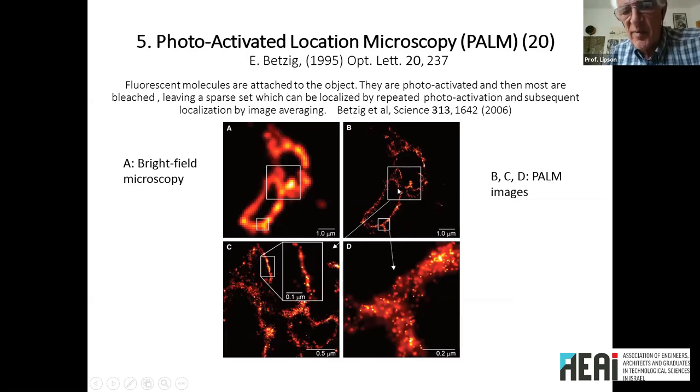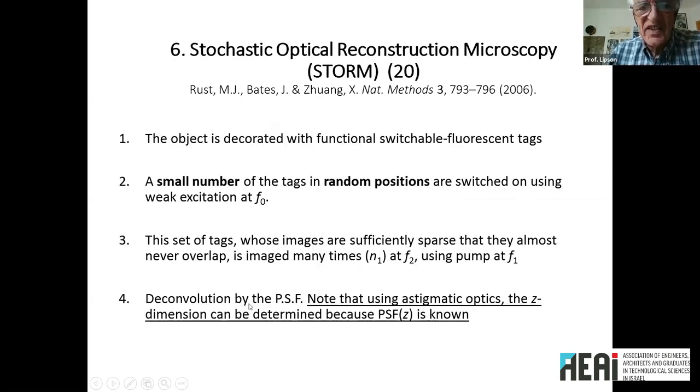You can see that this is what it looks like in bright field, and then this is the PALM, the PALM system which I've just described, and you can take a little bit of this and you can divide. And so you get very, very high resolution, and you can see here you're getting points which are individual points, fractions of a micron in size. So these are just the stages.